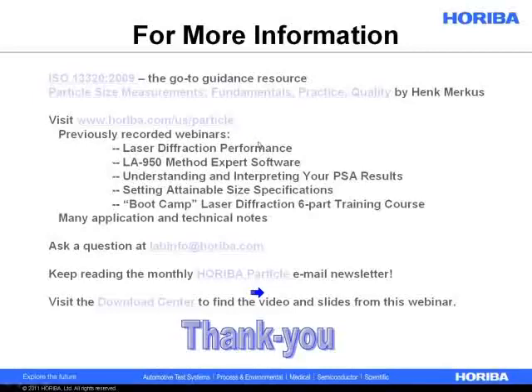What we typically do in our applications lab is when we get a novel material in from a pharmaceutical company or from a university or from whomever, and they haven't measured the refractive index or it can't be measured, we usually just pick a generic refractive index of 1.60 and stick with that. And that way, if anything happens to the product over time or if the process changes, so long as it's consistent, the analyzer will be able to tell you that something is changing. It's when you start changing it and you're not consistent that you can't really trust the results.